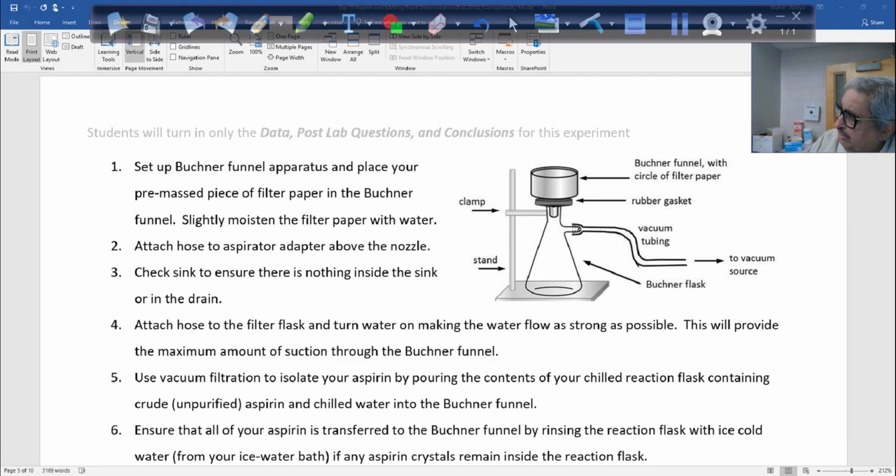Next week when we come, we will test the alcohol, this phenol, with iron chloride. If we still have phenol there, alcohol with iron chloride will be purple. Iron chloride is a yellow solution. And when you add a small tiny bit of your crude aspirin, if you still have phenol, you put some of your aspirin, a little bit, just after weighing it, of course. You have to weigh. Don't take anything. After we come back next week, you will weigh your aspirin.